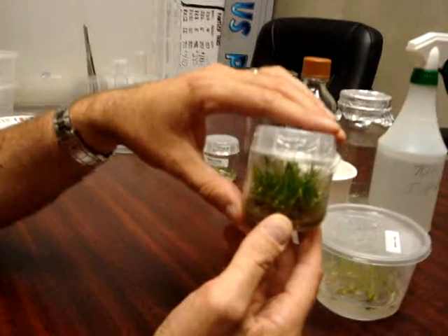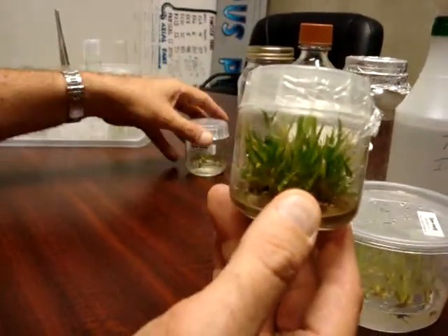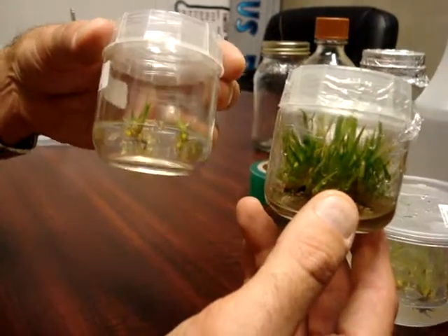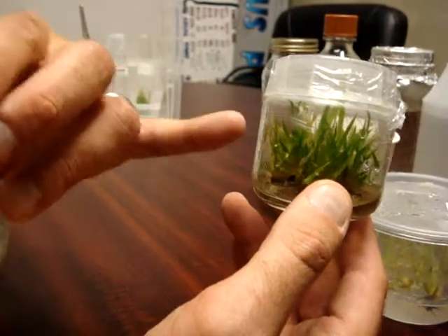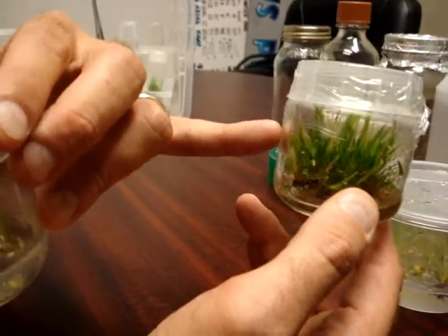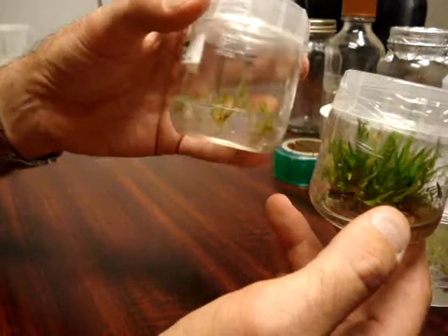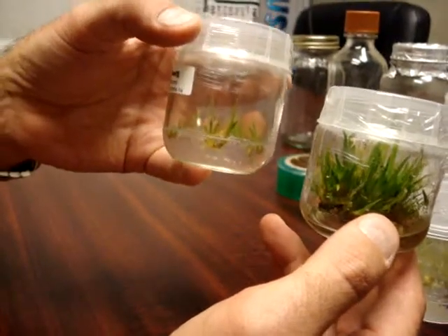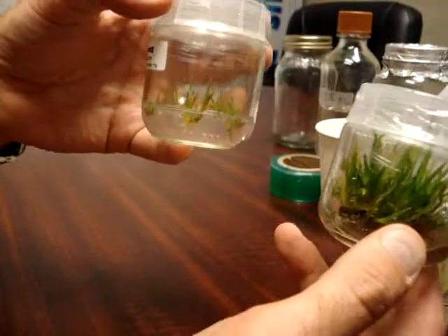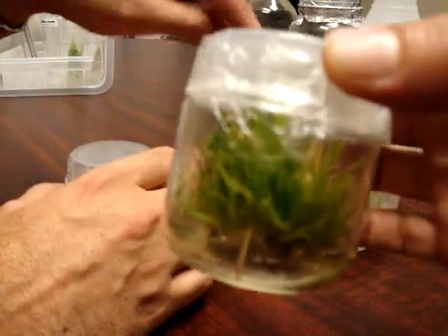This is the end product of a multiplication jar. This jar started just like this about five weeks ago. When it has grown to this size — and this is our target, this is your goal — we are going to take a few cuttings from this plant to make a brand new jar. This has the multiplication hormone on it and will go back on the shelf. The rest of the plants — which you can see is many — will all be separated, divided on a plate, and planted into a tub.